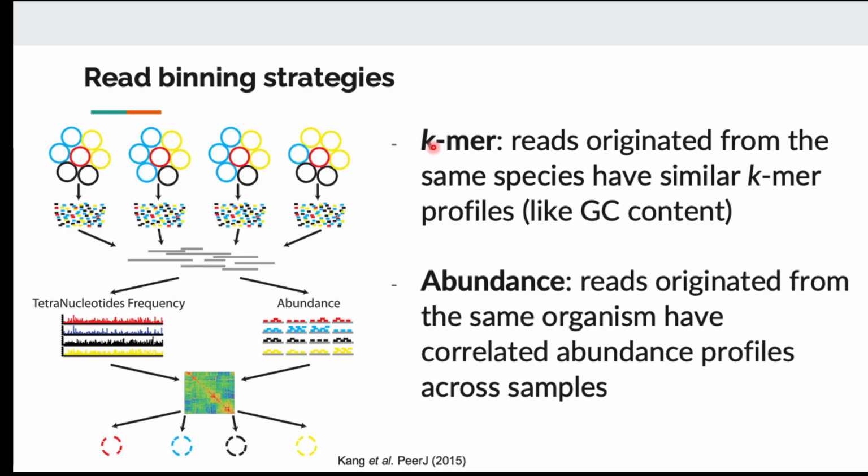We saw that if we have a k-mer from our read mapped to a certain taxonomy, like using a ribosomal RNA database, we can probably classify that read as being from that taxonomy. But remember that for shotgun metagenomics, a read can come from any gene, even from a non-coding region. So it can be anything, and we cannot classify the taxonomy like before.